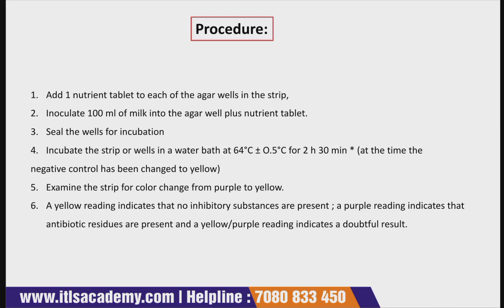Then you seal the well and set it for incubation.